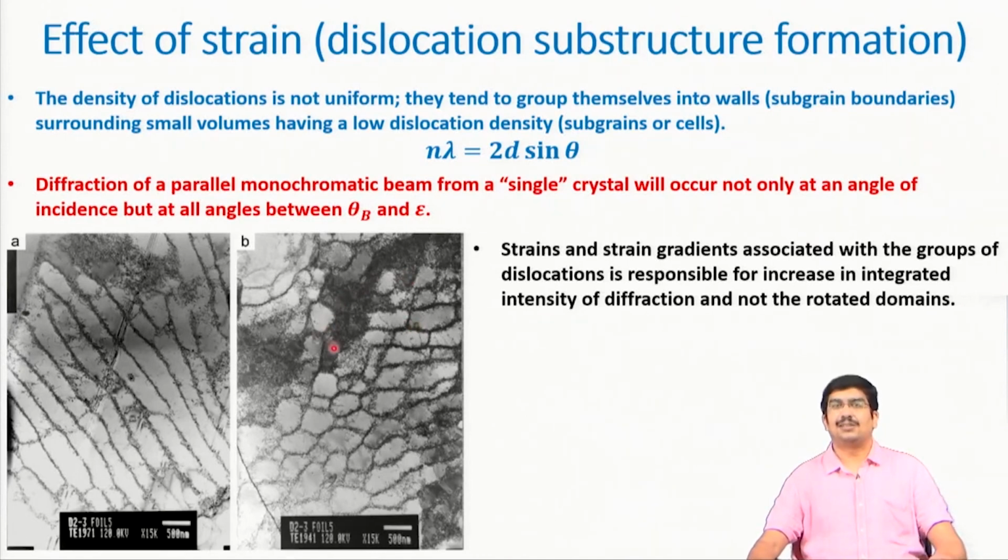So, these are taken at this dislocation contrast, and what you can see is that dislocations are forming very nice boundaries here, which are known as the subgrain boundaries. Basically, when the dislocation density becomes very high, those dislocations form this kind of boundaries within the materials and further divide the original grains into smaller subgrains, and within the subgrains these areas are very much dislocation free. So, all the dislocations are accumulated at these boundaries.